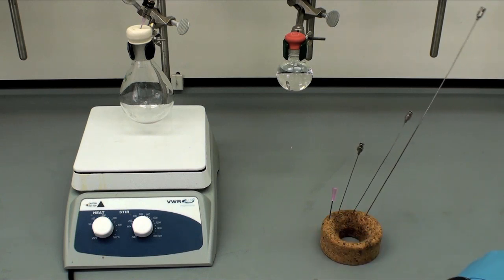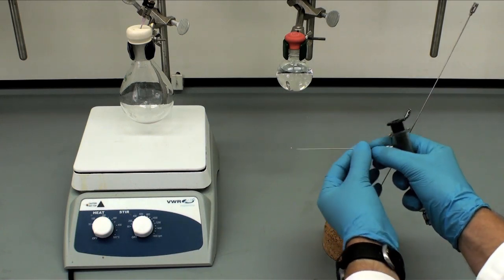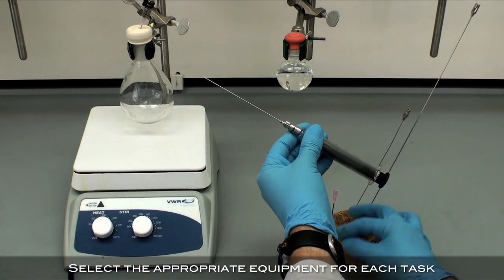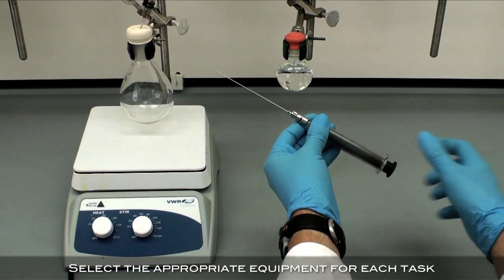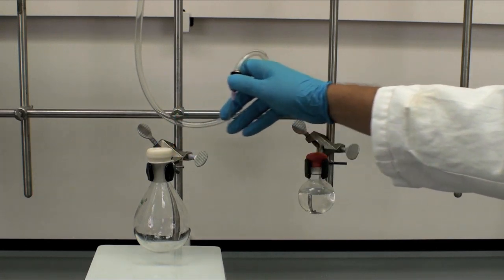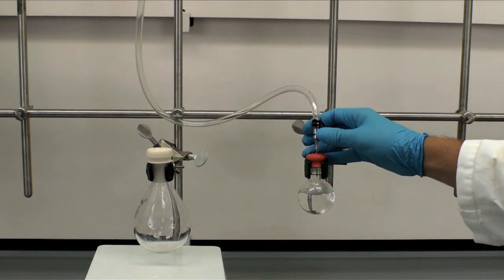Okay, for small amounts, it's good to use an airtight syringe. Make sure to use a long enough needle to reach the liquid. If the needle isn't long enough, it forces you to tilt the bottle, which isn't safe. You need to connect a nitrogen line to the flask so that when you pull up the plunger on the syringe, you don't create a vacuum.